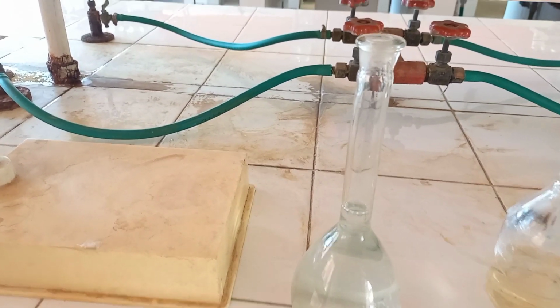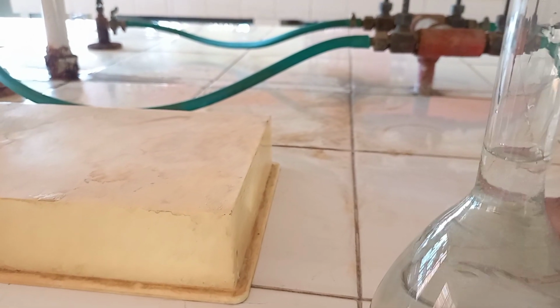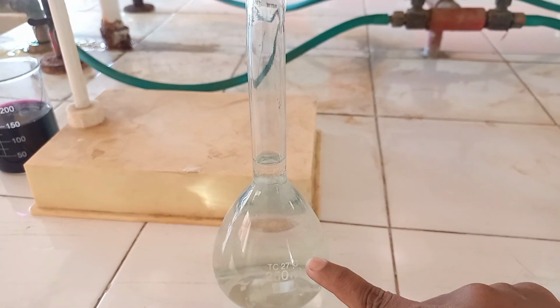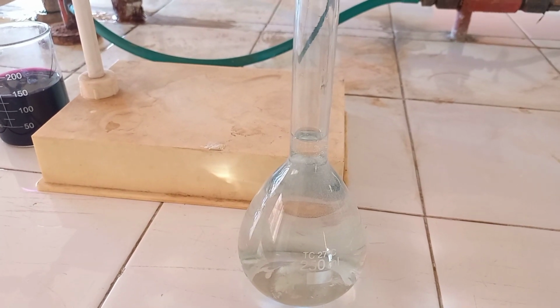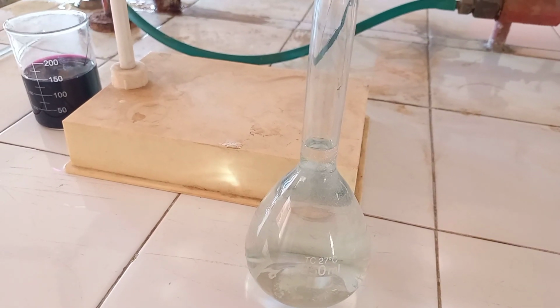And then this is considered a standard solution of Mohrs salt. Here you can see that exactly up to that mark we have done the preparation of salt plus water. Right? Now in the next step, we are going to study the procedure for titration.